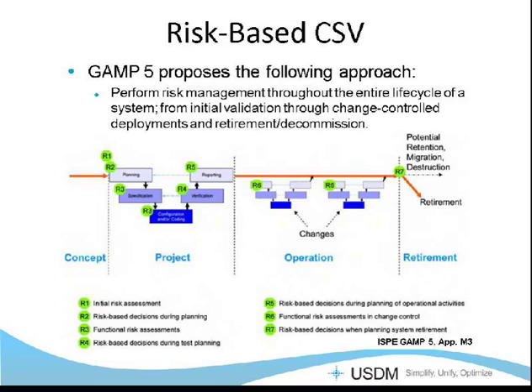And then again, at retirement, there's risk assessment, even just prior to retiring your system. There's retention issues. How do you get the data back? Are we going to destroy the data? Are we going to destroy the system? Do we have to maintain the system? And what's the risk if we don't?